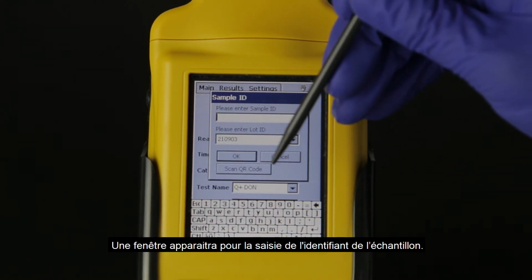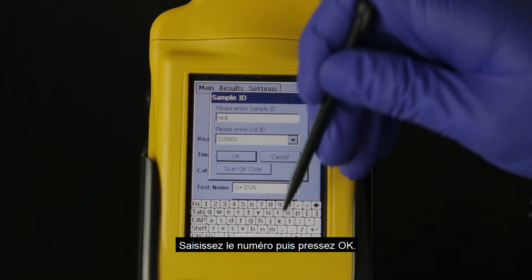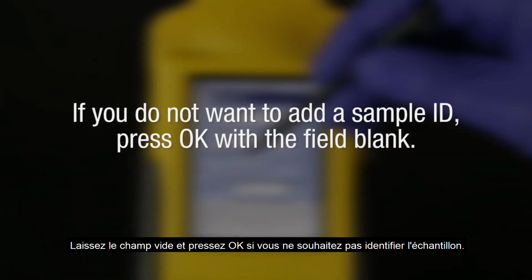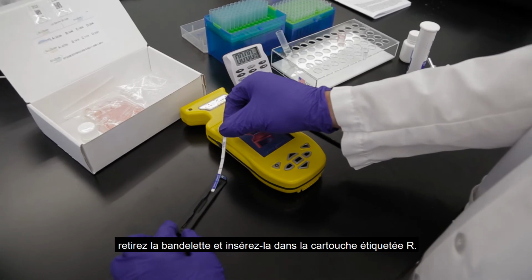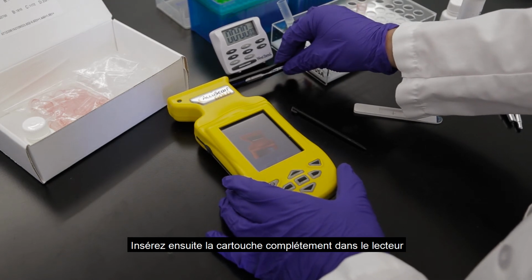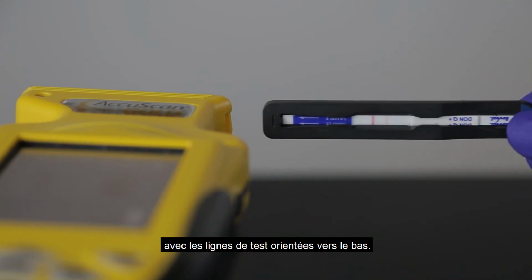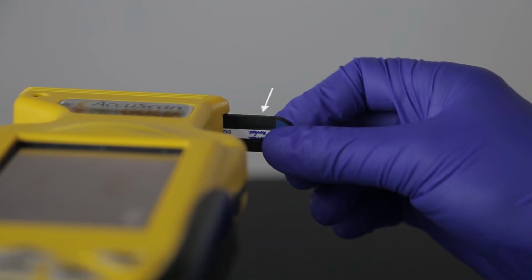A window appears asking the user to input a sample ID. Enter the ID and press OK. If you do not want to add the sample ID, simply press OK while leaving the field blank. Following the 3-minute incubation, remove the strip and insert it into the R-labeled strip cartridge. Fully insert the cartridge containing the strip into the reader, upside down, sample port end first. When correctly inserting the cartridge, the test lines face downward into the reader.